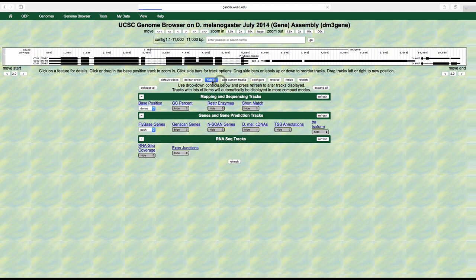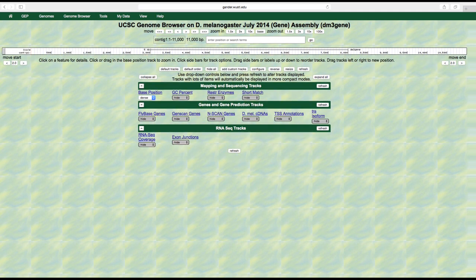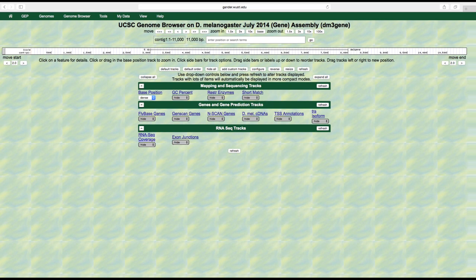Let's first hit the hide all button so we can choose which features of the genome we want to view. We use the term features in bioinformatics as a catch-all term for anything associated with the genome. Each of these features can be highlighted or displayed along with the genome sequence as a track that can be viewed in the browser. We can turn on and turn off various tracks and also adjust how each is displayed.